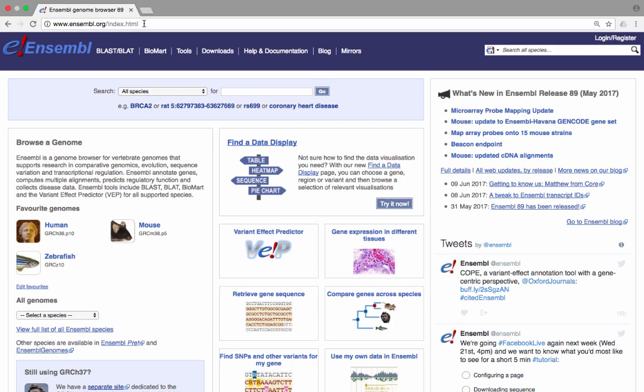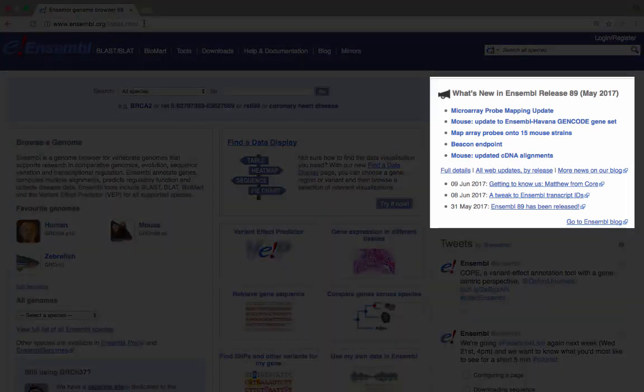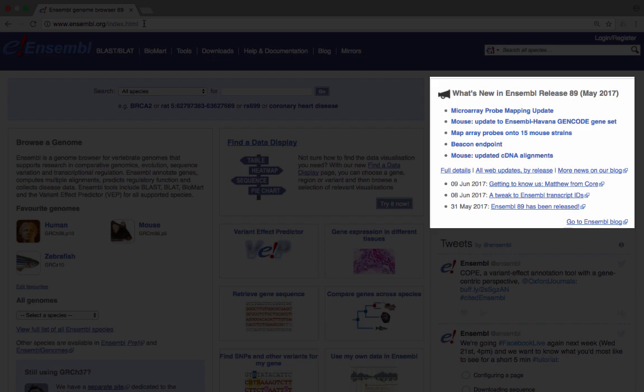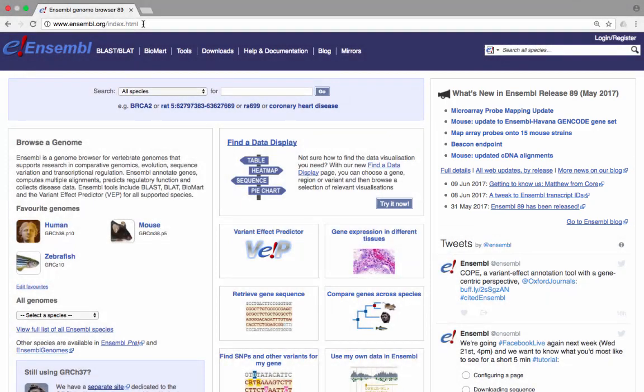Every two to three months, the browser and underlying databases are updated, which is all included in a single release version. The news in the top right of the homepage shows the current release version and announcements of the incorporation of new data, as well as updates and changes in the annotation. An archive link is present at the bottom of every page, which allows you to access older versions of Ensembl.